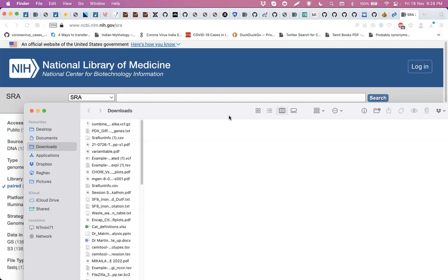So why would one use Shannon diversity matrix over Faith's phylogenetic diversity? Excellent question. So Shannon diversity, not only, for example, let me stop sharing and reshare one more time. Okay. Faith's gives you phylogenetic diversity. Shannon diversity is actually related to, you can calculate, for example, species richness, how diverse each and every sample is, right?